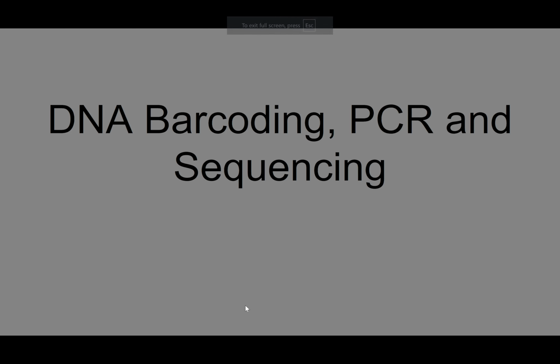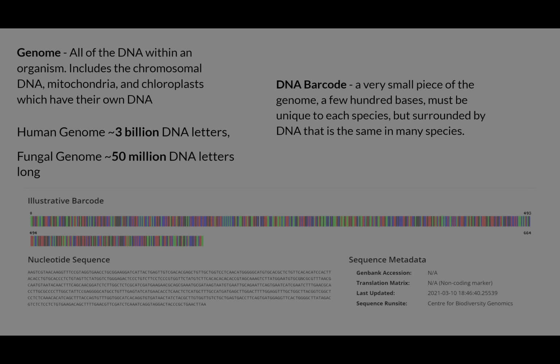Alright, let's talk about DNA barcoding, PCR, and sequencing. First, let's define a few terms. When we refer to the genome of an organism, it's all of the DNA that resides inside of it.